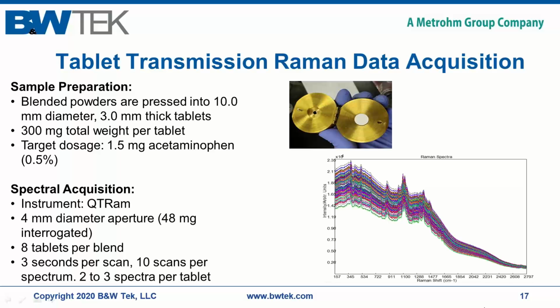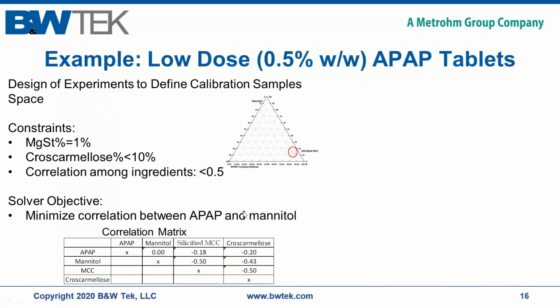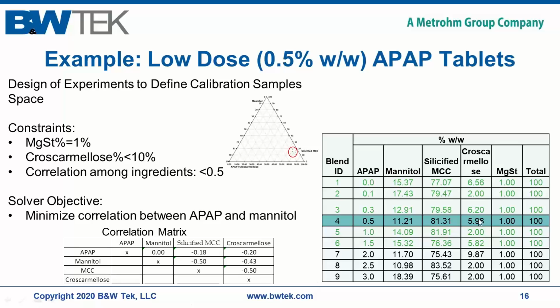So would you be able to explain how to perform the blend analysis? Well, you would need to have your sample blends as we have here in this same way, have samples of different concentrations, and to make the measurement of each one of them.